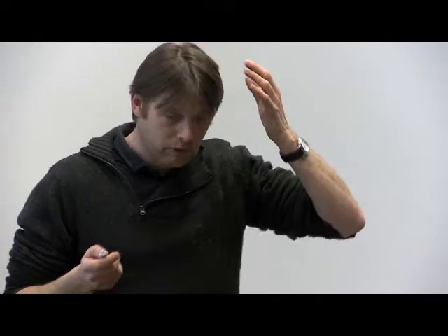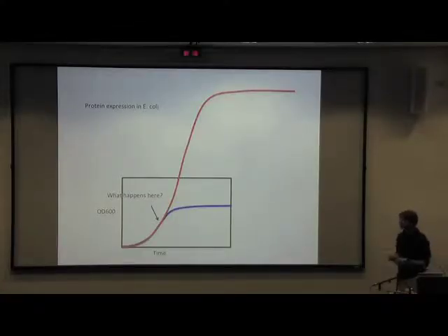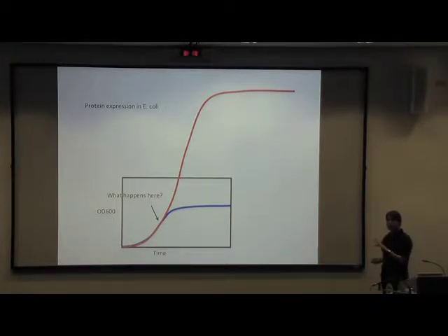Anyway, the point is we all kind of rely on methods that have been developed a long time ago. So when we typically do protein expression, you grow your bacteria for a bit, and then somewhere around an OD of 1, they leave the log phase and go into stationary phase. Now, there's actually something really cool going on. It has to do with invasion of a host, protecting itself, and there's biological warfare going on, but that's not really important now. What is important is that they stop growing and they completely change their metabolism.